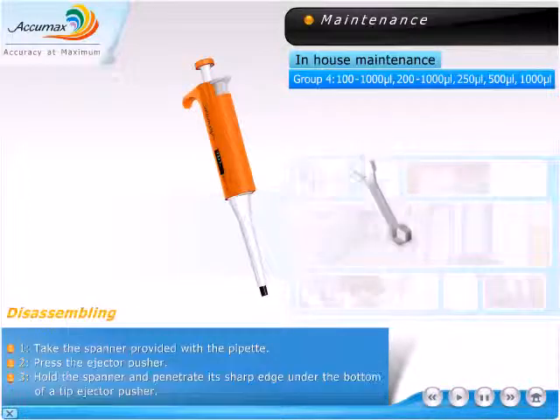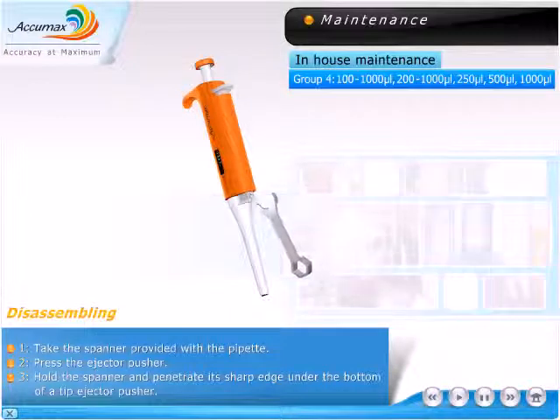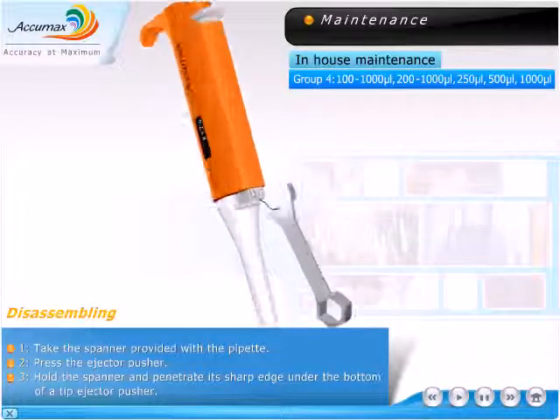Disassembling. Take the spanner provided with the pipette. Press the ejector pusher. Hold the spanner and penetrate its sharp edge under the bottom of the tip ejector pusher.